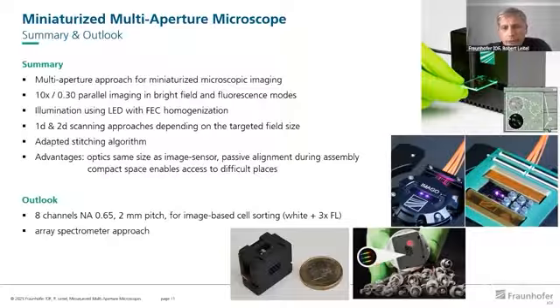And it is then possible to have more than 30 channels available for different analysis at different positions, because this is a fiber coupled concept, and each fiber, of course, could be pointed to a certain different spot.